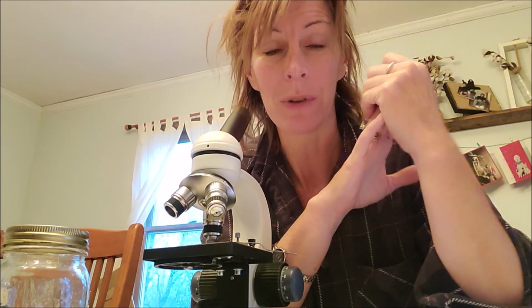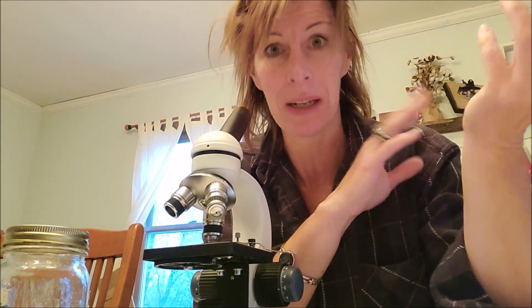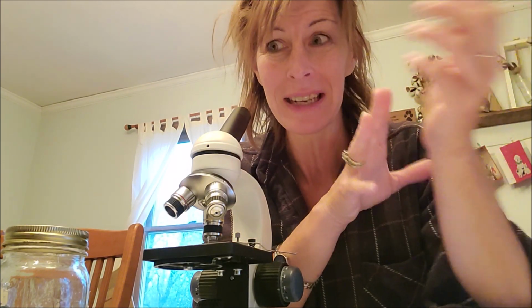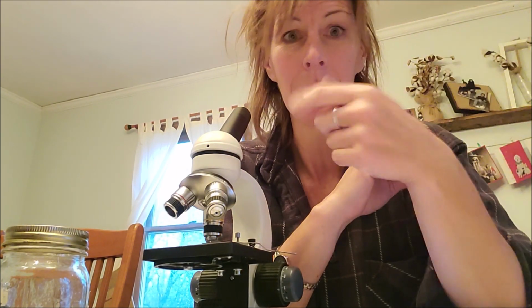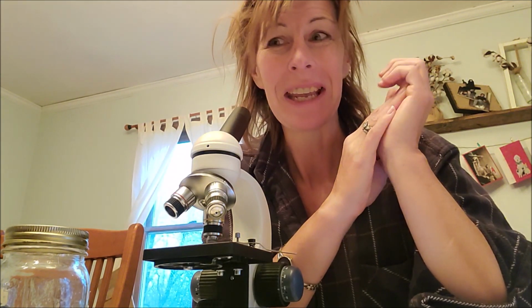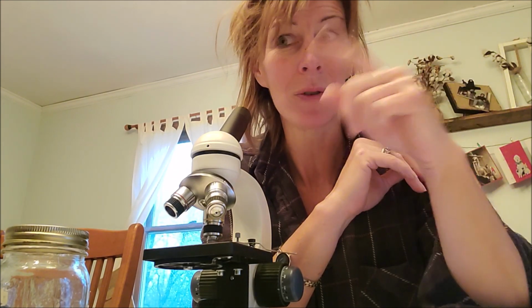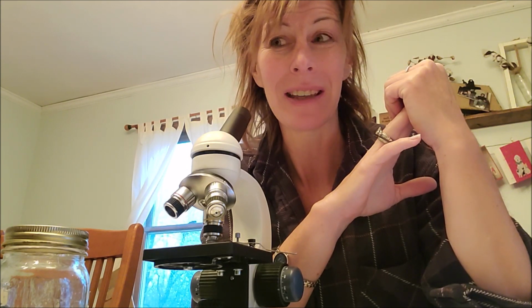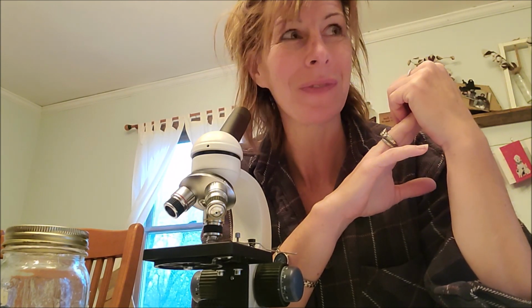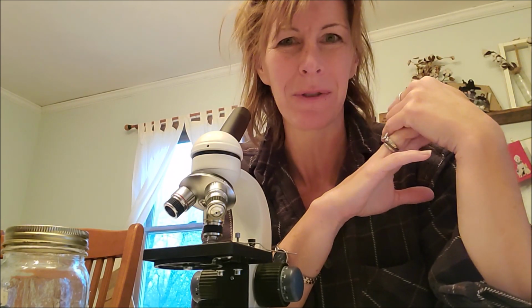And then we're gonna retest him. And that will let us know whether he is resistant to any of the medications that we're giving him. And if he is, then we switch gears and we give him a dose of Quest. So that's the game plan. And we're gonna do this in 10 more days. So basically the day that we move him nose to nose is gonna be the day that we retest him. We'll see what happens. So I won't go through all of this the next time. I'll just give you guys an update.